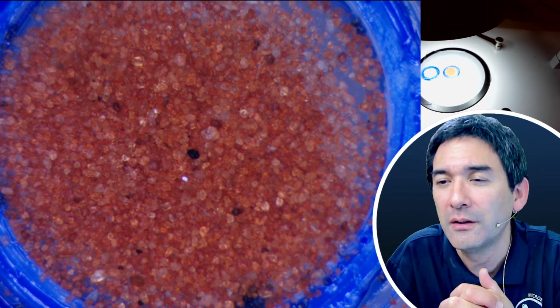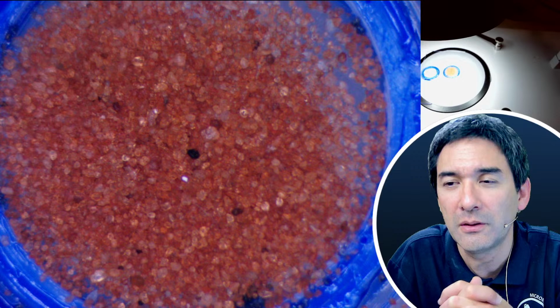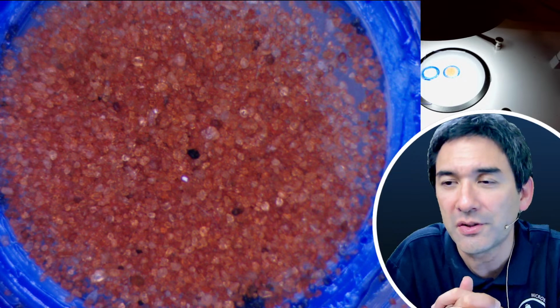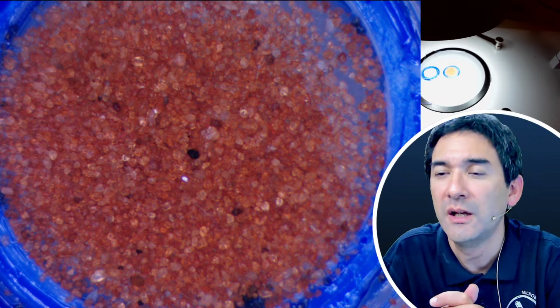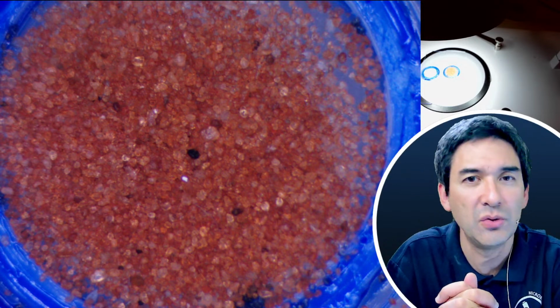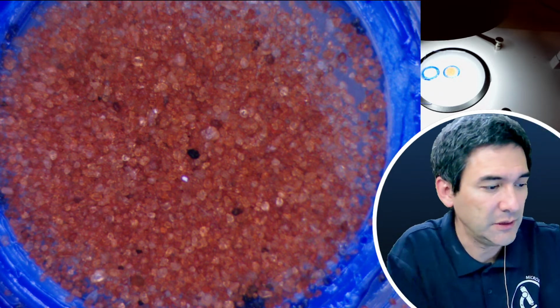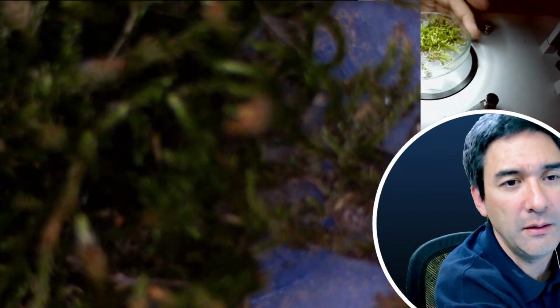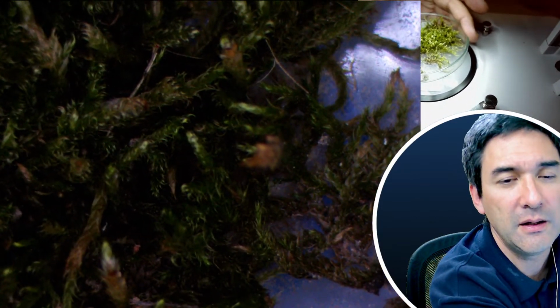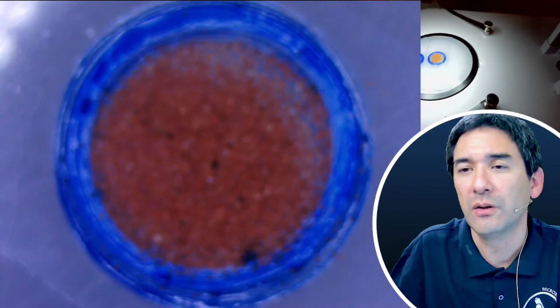Where is it better to search for microbears? Near a pond, in a forest, or in puddles in the city? I guess you are talking about those water bears, or how do you say, moss piglets. What you do, for those moss piglets, you need to find fresh moss. I've got not so fresh moss here, which you've seen already before, and essentially if it's fresh, then chances are pretty good that you're going to find water bears in it.